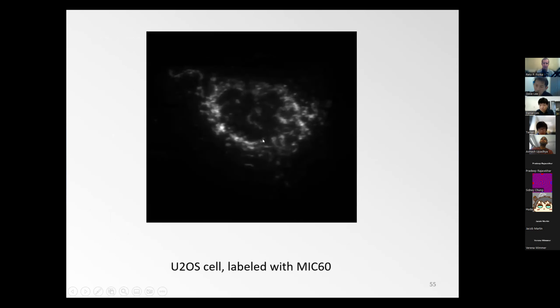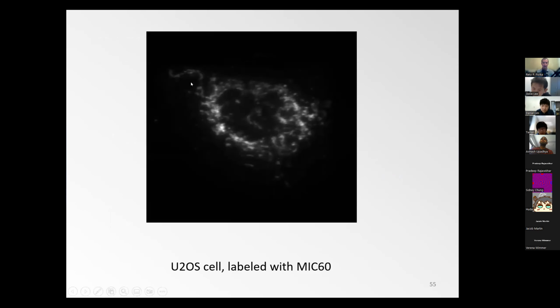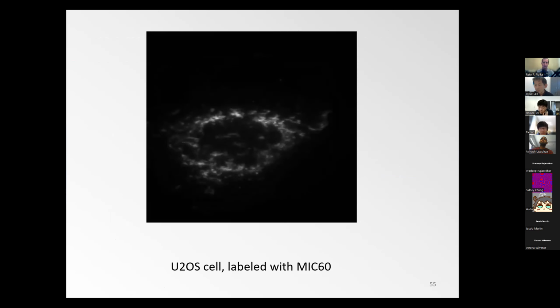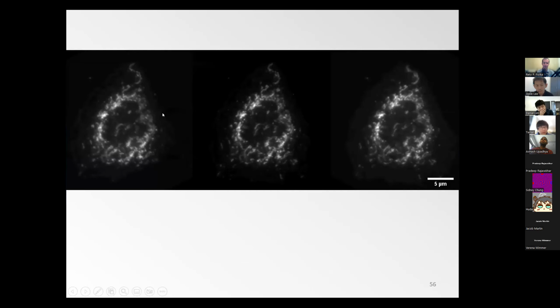So this is done here. These are actually projections of a cell with mitochondria under the 3 different orientations of the oblique structured light sheet, squished or projected exactly into the same coordinate frames parallel to the cover slip. So this is how the raw data looks. But if we co-register them, so squish them, rotate them, overlap them, then this actually looks much more like traditional SIM data. If you could zoom in, you could actually see that the patterns run in these different directions. And when you overlay them, the data overlaps quite nicely.